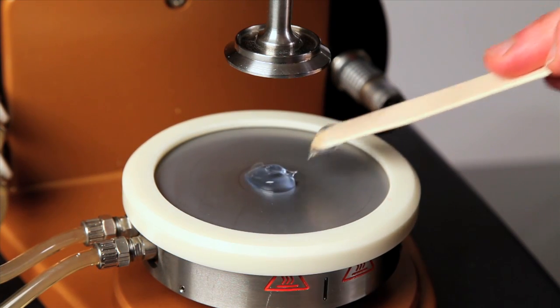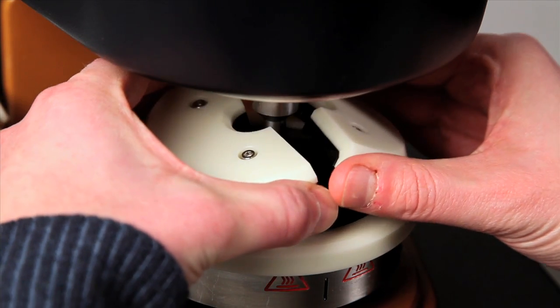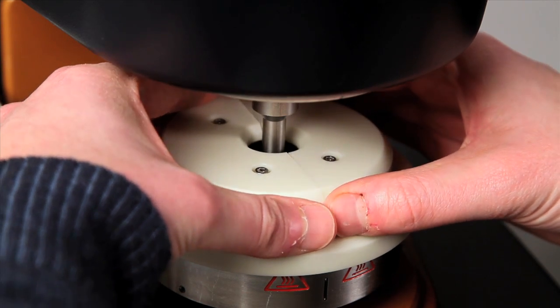After loading the sample as usual, you just have to fit in place the two halves of the solvent trap cover, without worrying about touching any part of the geometry. You are now ready to start your experiment.